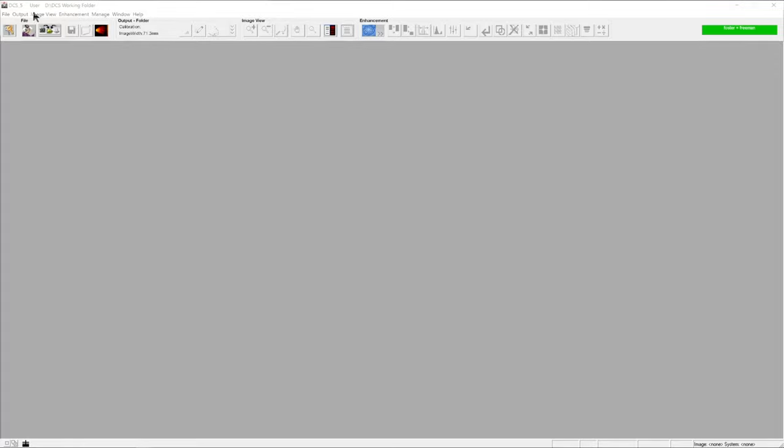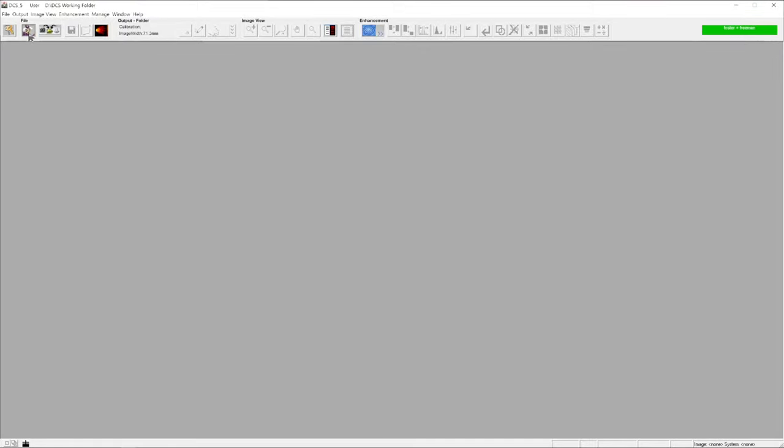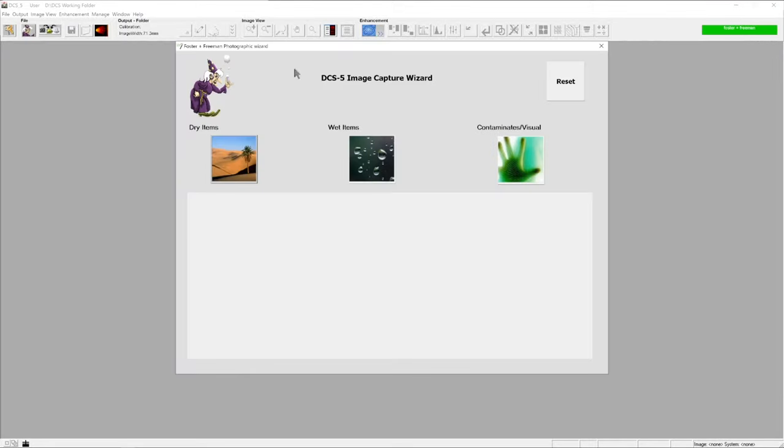The main photography resource that we have within the software is the DCS wizard. The wizard can be accessed from this top left-hand control, and that will open up the DCS capture wizard window. This is such a huge and useful resource for examiners.